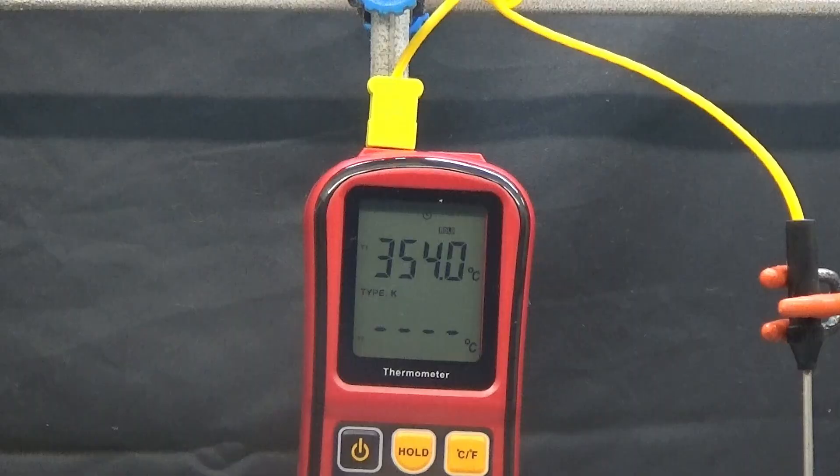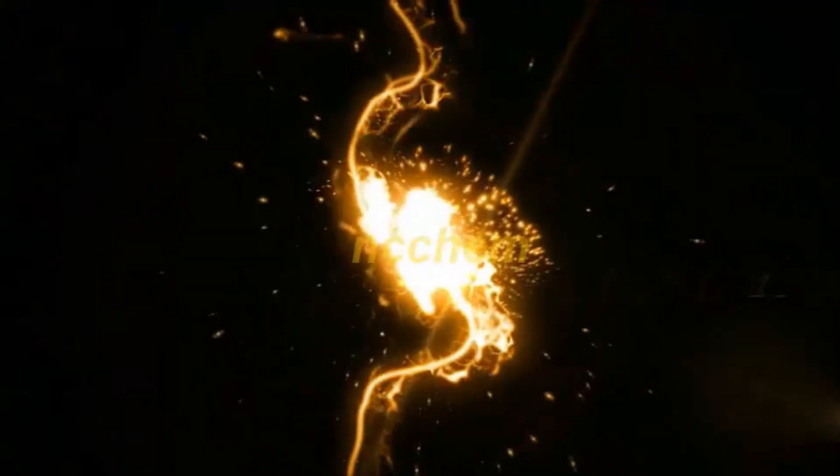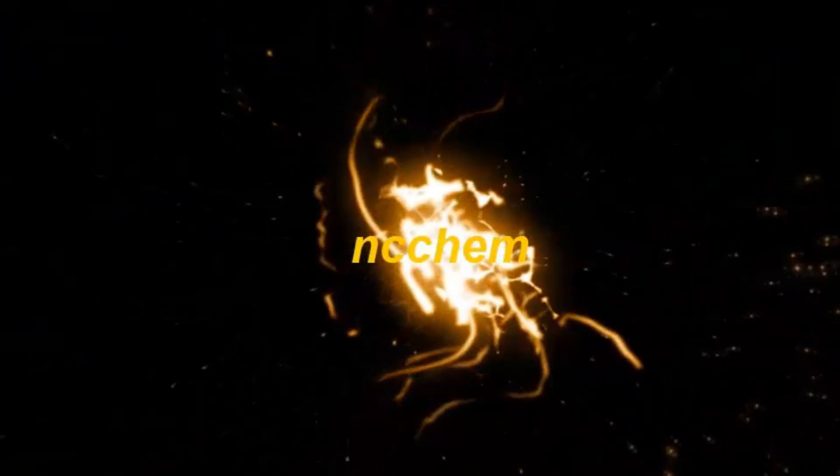The test was not very accurate but sufficient to determine that the product obtained has a melting point greater than 350 degrees. The total yield of this synthesis was 69%.